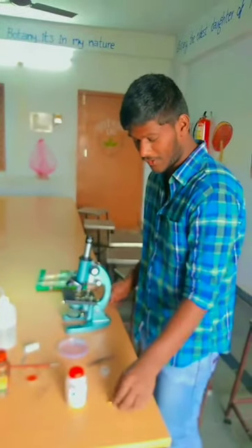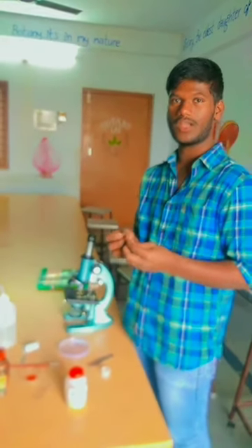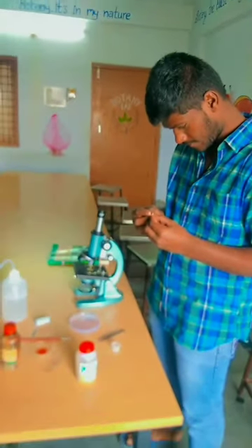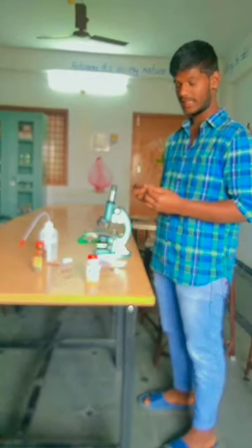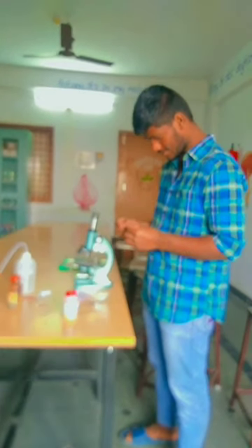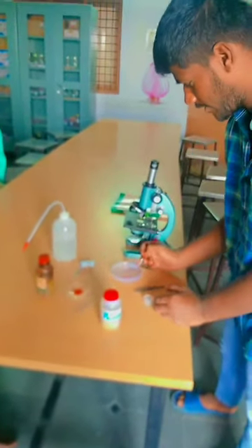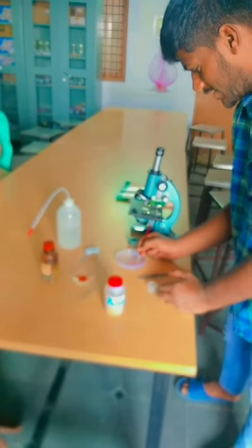First, we want to take the monocot stem and cut it into small and thin slices. After cutting, we put the slices in water for cleaning.